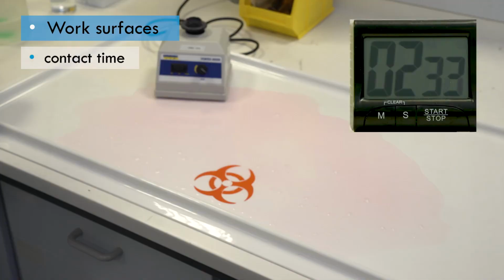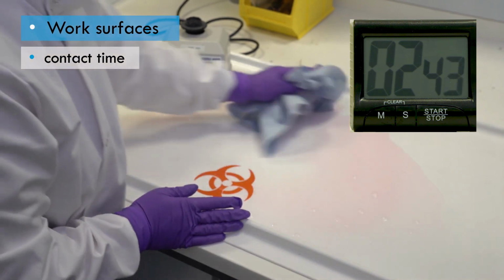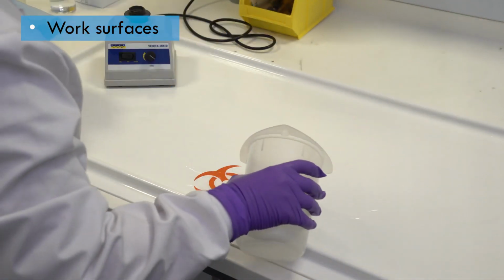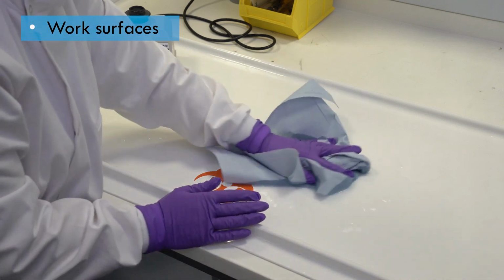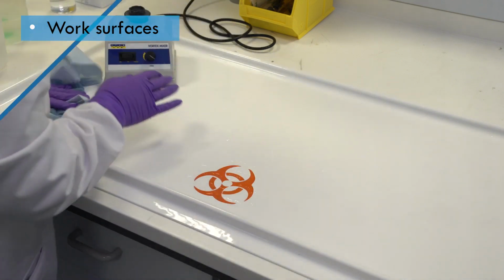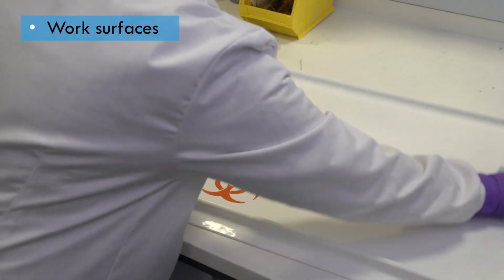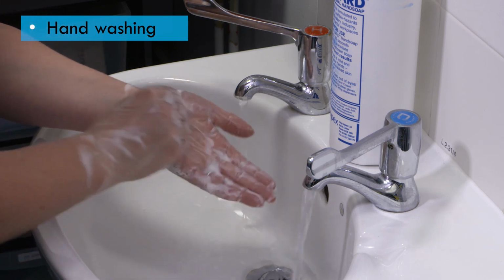The disinfectant must then be left for the required contact time. If the disinfectant evaporates before the contact time is up, the timer should be stopped and disinfectant reapplied before restarting the timer. If the disinfectant is a type that leaves any chemical residues that could harm skin or damage the work surface, these should be wiped away using clean, sterile water. Finally, the surface must be wiped dry before use. Hands should be washed after any decontamination procedure.